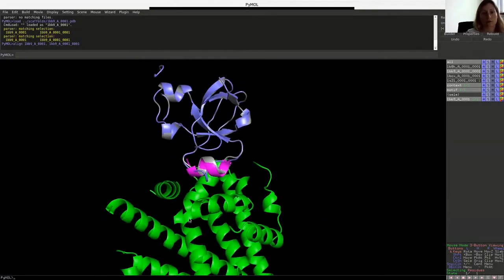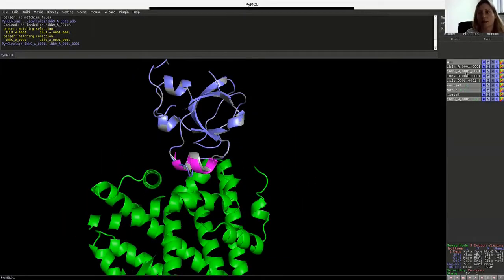Okay, this looks really cool, like a very successful graft. So this is the backbone of the protein in this region, which you see is very different from being helical. This is the motif you're interested in, and if you align this, this doesn't align very well in this section at all. If you would revert some residues here, you would never get the interactions you wanted. However, what you can see is that these N and C termini are aligning relatively well, and this is what the protocol looks for.